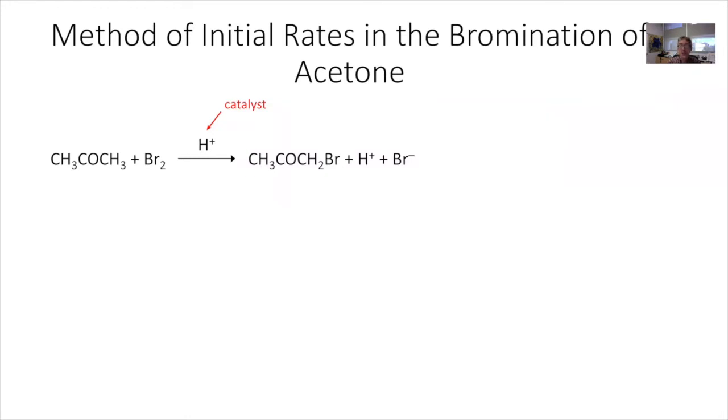This reaction you will carry out in the presence of a catalyst, hydrogen ion, so that the reaction completes in a reasonable time in the laboratory. Now, a word about why you're doing an experiment on chemical kinetics. Characterizing the rate law of a reaction is an important step in understanding the reaction. If we know the rate law, we can predict how long processes will take under different conditions, and this can be important for industrial processes as well as for academic research.